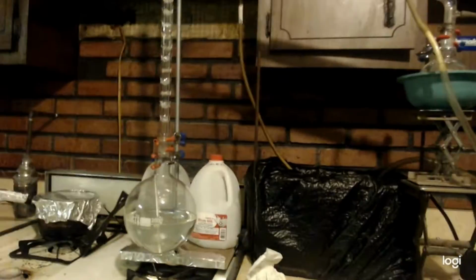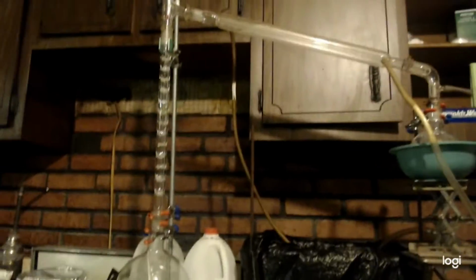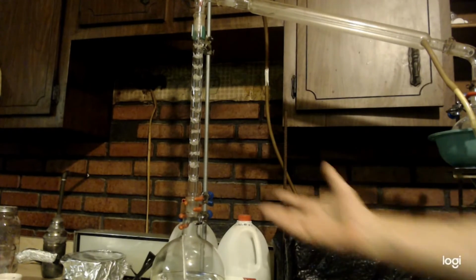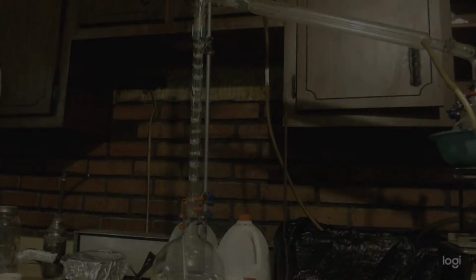I have the Vigreux column so that if there's any soap in there, I don't know what the deal is with the soap. If there was no soap, it'd be no big deal. But with the soap, it might come up with it. I don't know. But we'll soon find out.